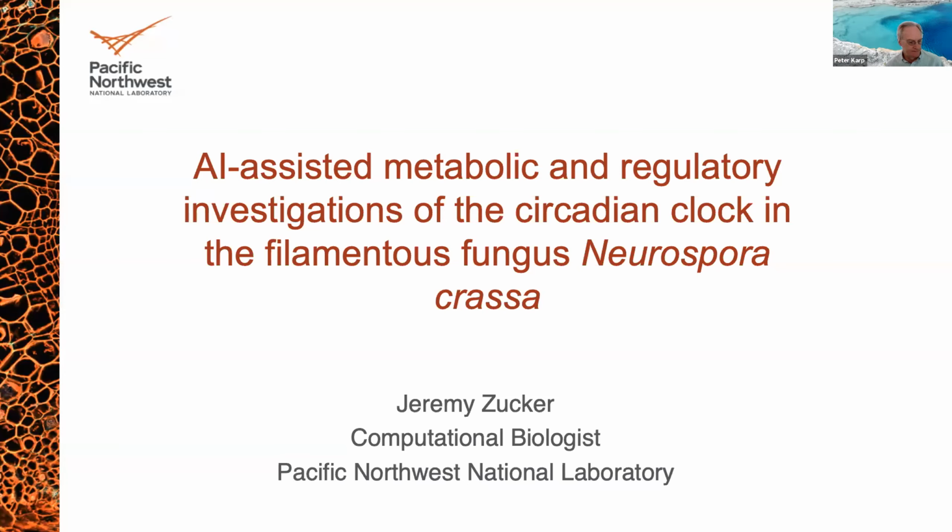Looks great. Okay, good. So first of all, I just want to finish answering the question from Christiane Hassenrook, which is that there are 4 choices for multiple hypothesis correction in the enrichment analysis. And you have to specify whether it's spatial or temporal data with the columns that you include in the smart table that you analyze. I'll just go ahead and send that right now.